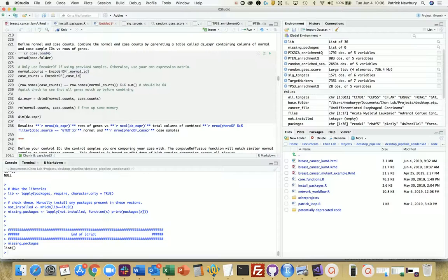Down in the case.load4 chunk, this readies the encoder DF matrix by subsetting only the samples of interest. This matrix will be used to determine which samples from normal ID are most similar to those in case ID. Only samples we included in our original publication will be present in encoder DF. You can add new samples to this with significant knowledge, but generally new samples will be absent. For any samples, old or new, you can alternatively use count data, TPM, or whatever other form of expression matrix to evaluate similarity. Just change this matrix.